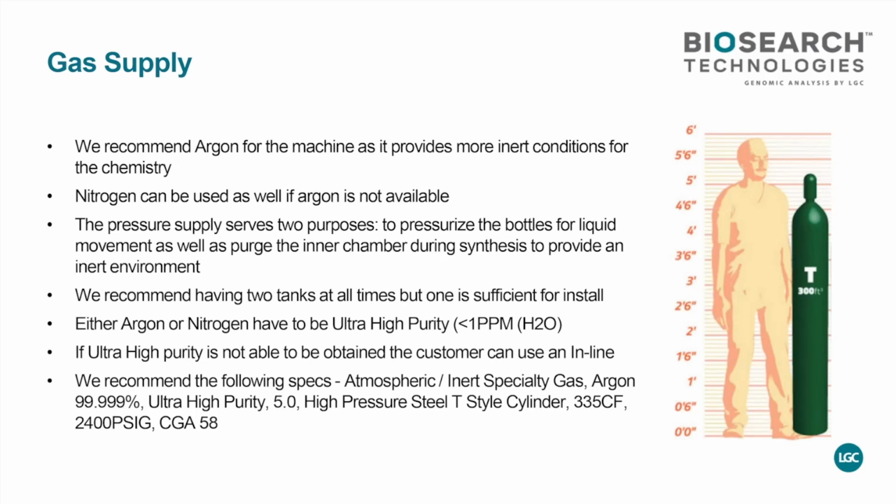The reason is the gas pressurizes all your reagents, and if there's a lot of water in it, it would permeate into your solution, and your solution of the amidites and reagents would not last a very long time on the instrument.